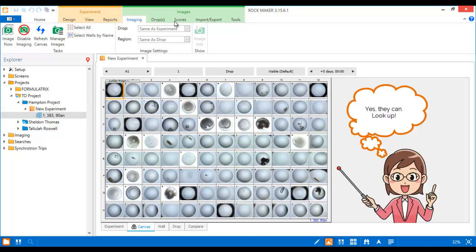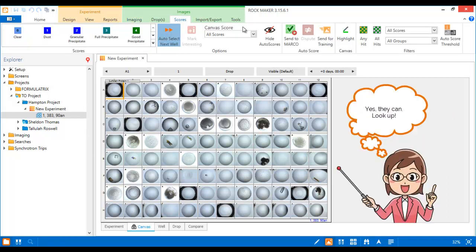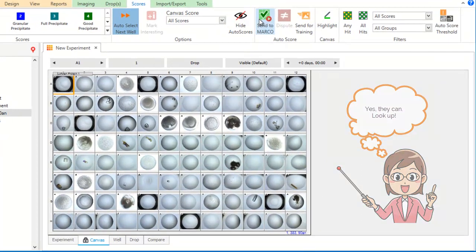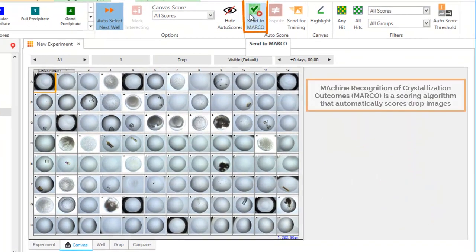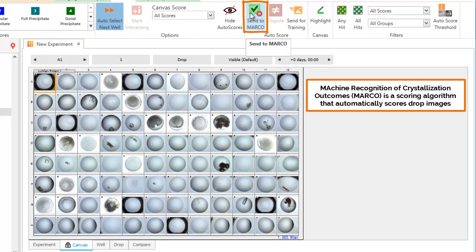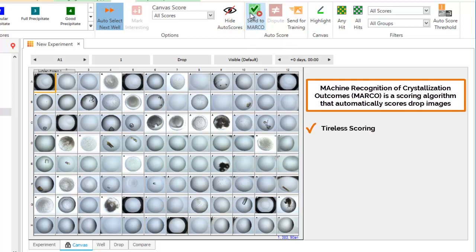Fortunately, it can. MARCO, which stands for Machine Recognition of Crystallization Outcomes, is a powerful auto-scoring algorithm designed to calculate the probability of non-LCP visible light images containing crystals, with up to 94% accuracy.